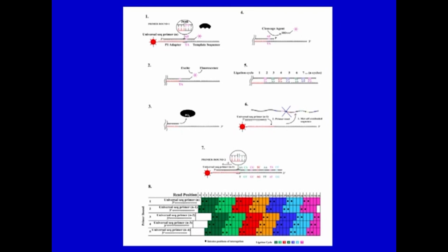Then again these steps are repeated and about 5 cycles are done, with one nucleotide removed each time, like n minus 1, n minus 2, likewise. This is summarized here. If you can see, this is the original primer, then there is the n minus 1 primer, the n minus 2 primer, and in each cycle there are certain overlaps, like these 2 bases were the first, and then the next 2 bases.